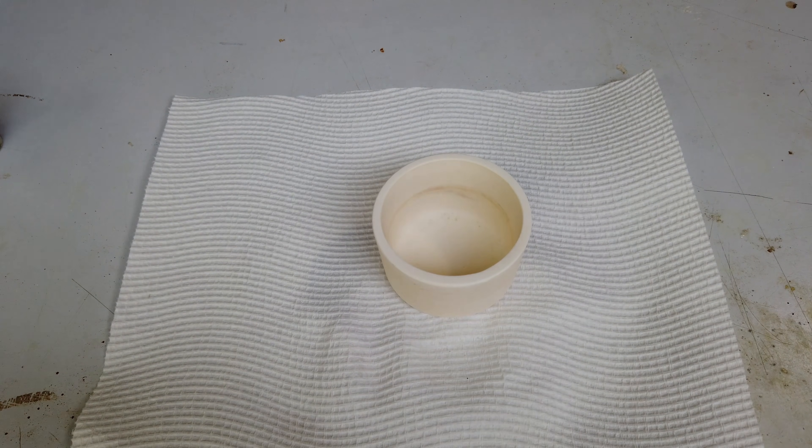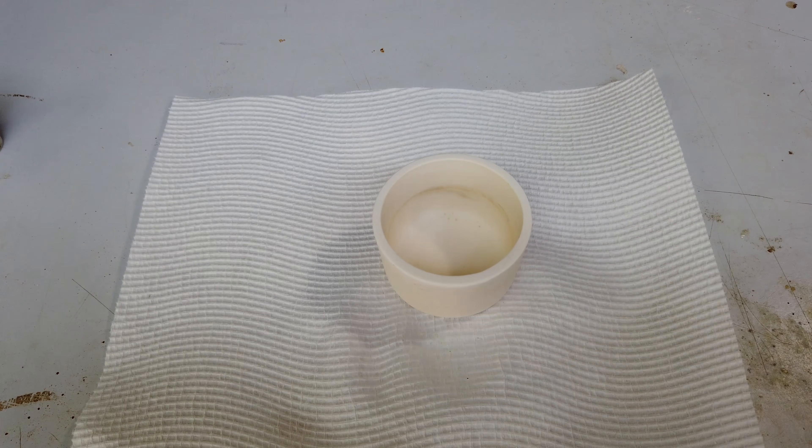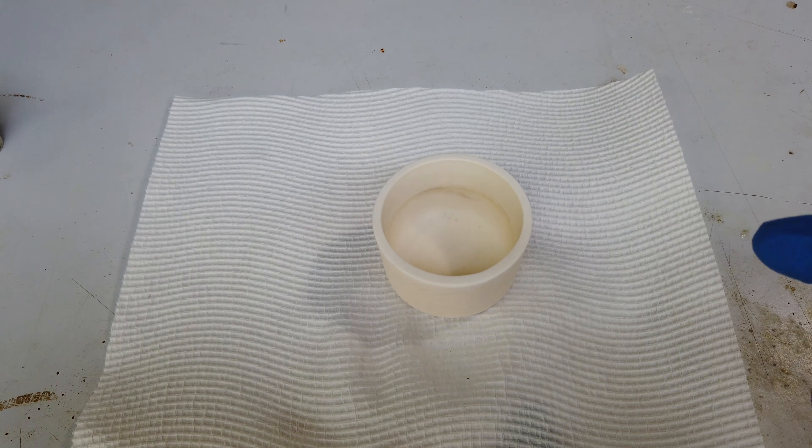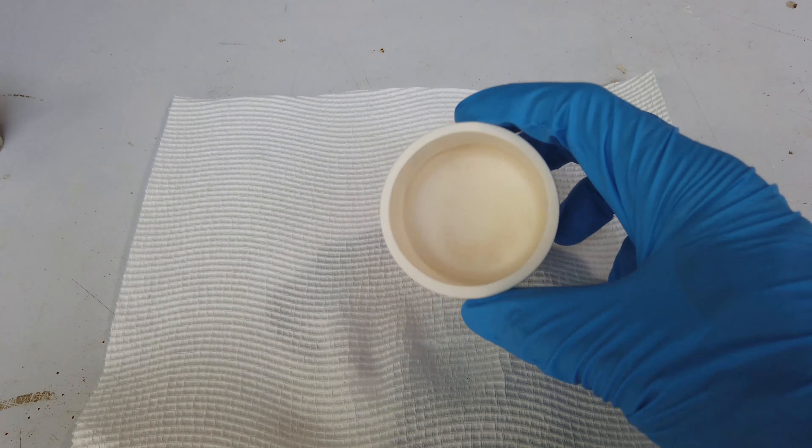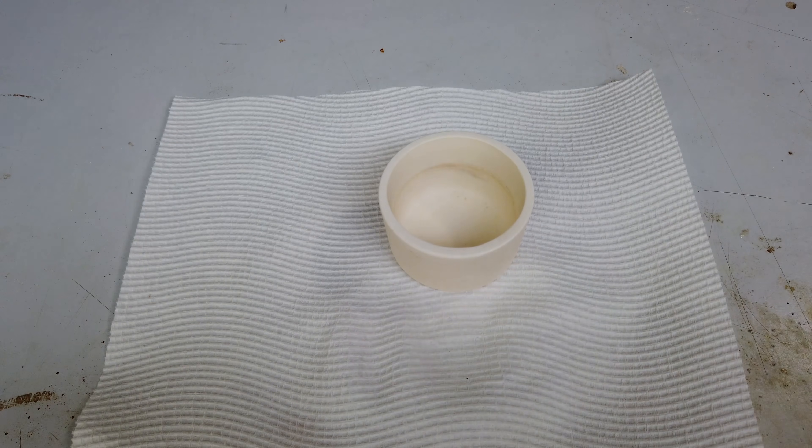I've got two ideas for how we can get around this problem of not being able to make potassium by molten salt electrolysis, but we'll cover those in future videos. My second idea for it will involve this thing. Regardless, I think today was a success.